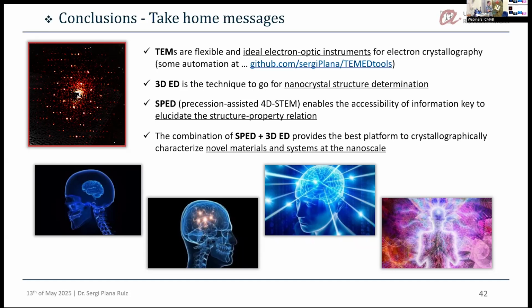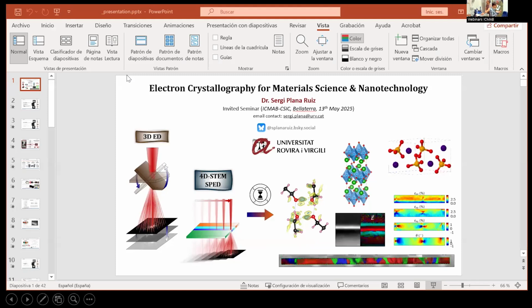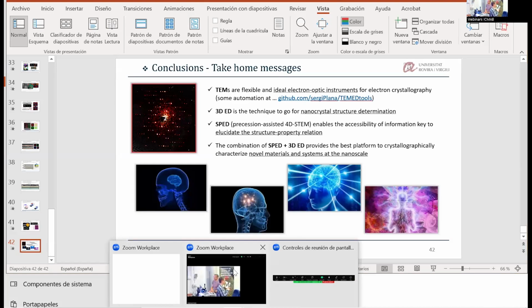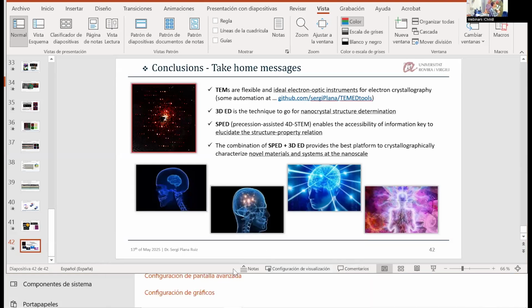Thank you for the talk. Regarding the imaging of domains, you need a Lorentz lens. I mean, magnetic domains. Yes, you need one. Obviously, the position where you put the sample in the objective lens usually has a magnetic field of 2 Teslas. It's huge, so this will preclude you from any magnetic measurement. So you need to work in a state of the microscope in which this is switched off. This is a Lorentz setup.